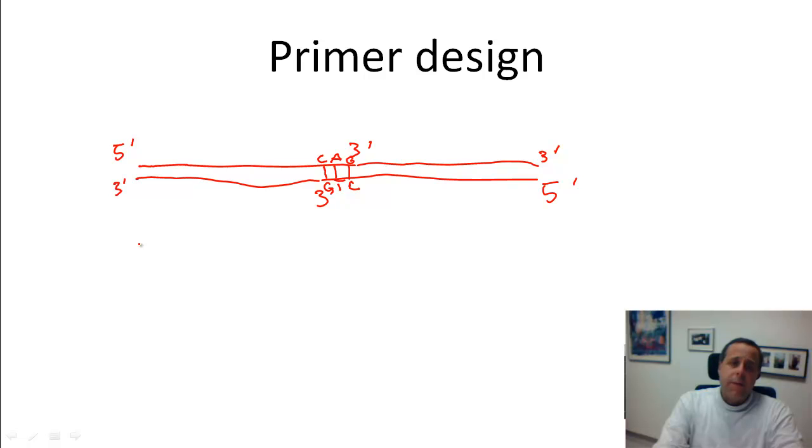You not only design your primers not to anneal to each other, but you also design them not to anneal to themselves. So let's assume these are two copies of the same primer. Again, the five prime ends being here.